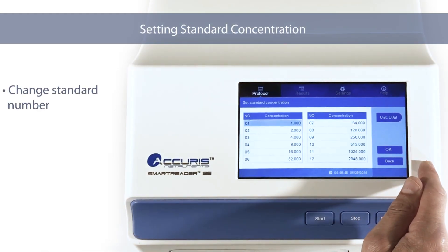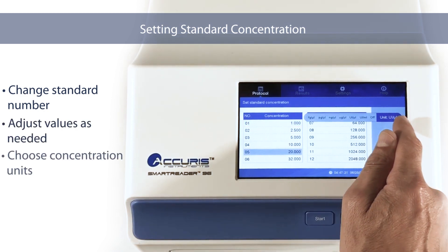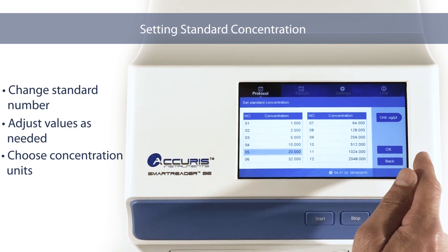Calculation Settings. Press the Concentration button to set the known concentrations for the range of standards. The units of concentration can also be set.